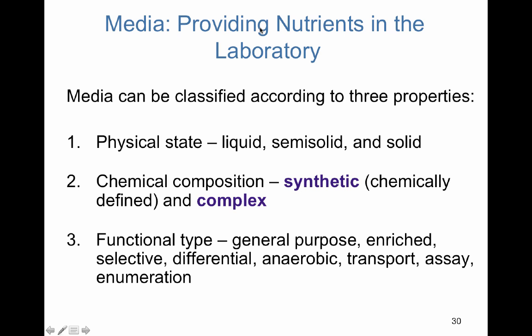Now, when you're working with microbes in the lab, how do we grow them? So you guys will be making agar plates and inoculating those plates with microbes, or we may be working with liquid culture. So the media that we're using to allow for these microbes to grow could be in liquid, also a semi-solid or solid on the agar. There are different types of chemical compositions of media.